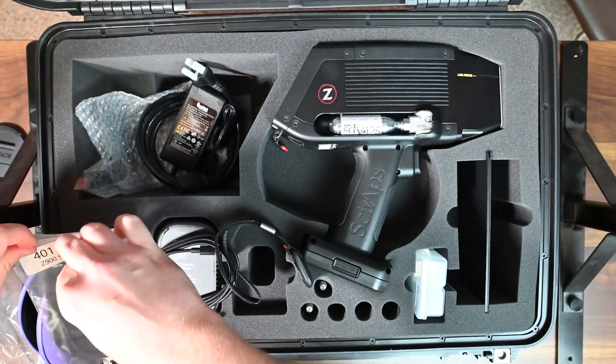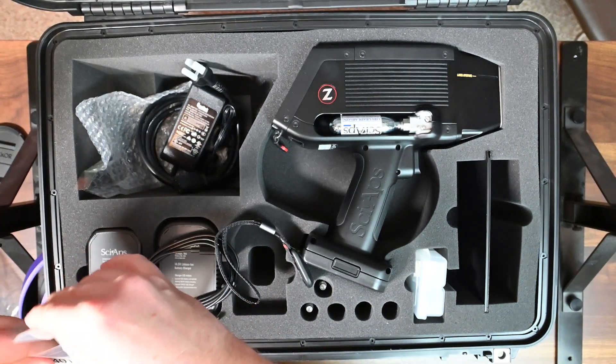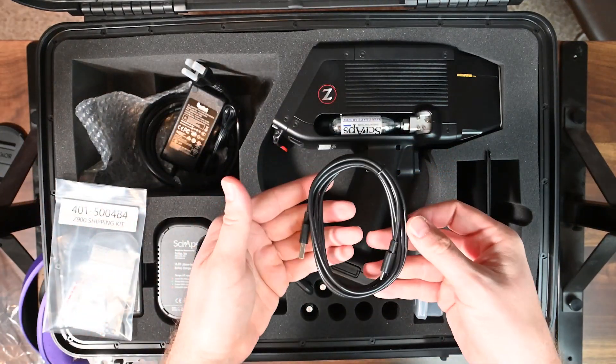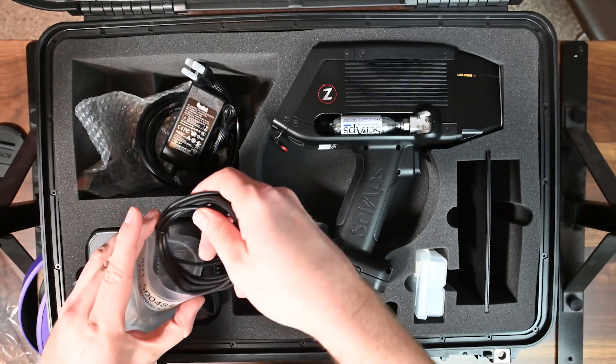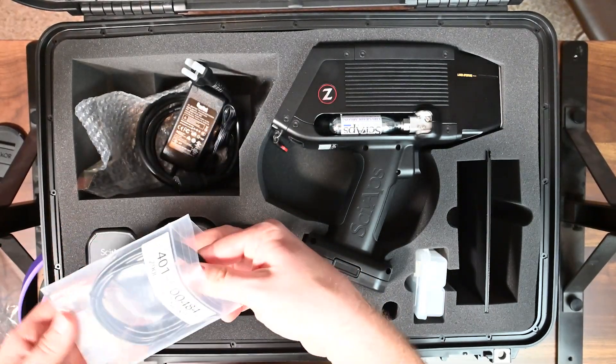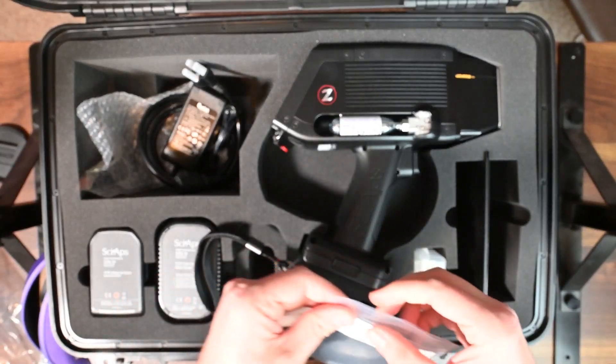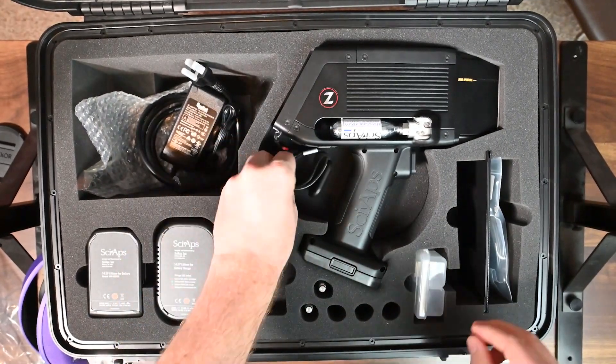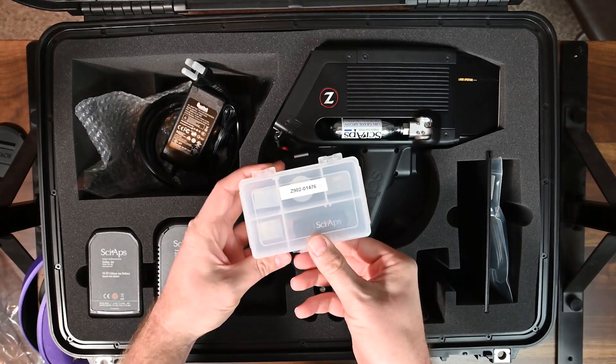There's also a USB cable — we talked about the USB port earlier on the device. It just plugs into that port and connects directly to your computer. It's nice to see those cords actually being shipped with the analyzers themselves.